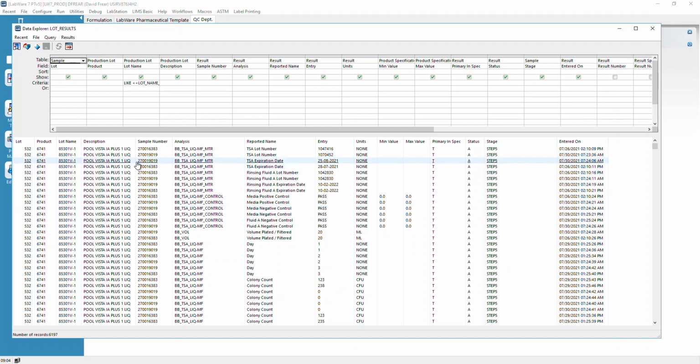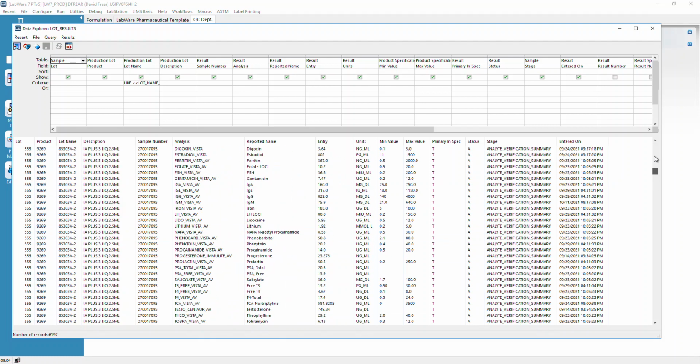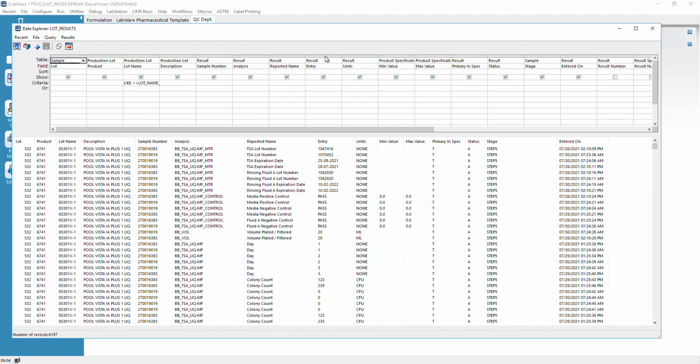And so what this has given me is all of the data for the master batch 8530, and then wildcard on 1V-1-2. So -1 again is typically the pools, -2 is typically the vials or finished product. That's dependent on when QA creates the lot in the order in which they create them. So if they don't create them in the right order, then they might be misnumbered.